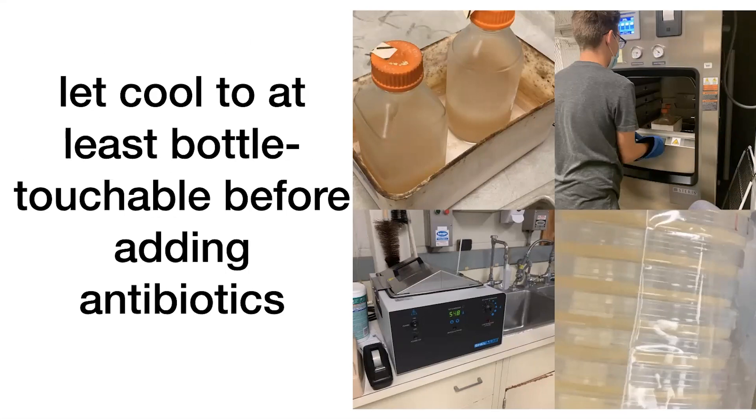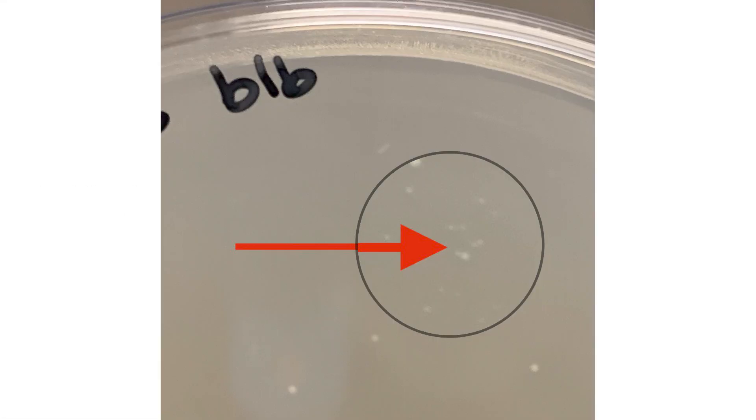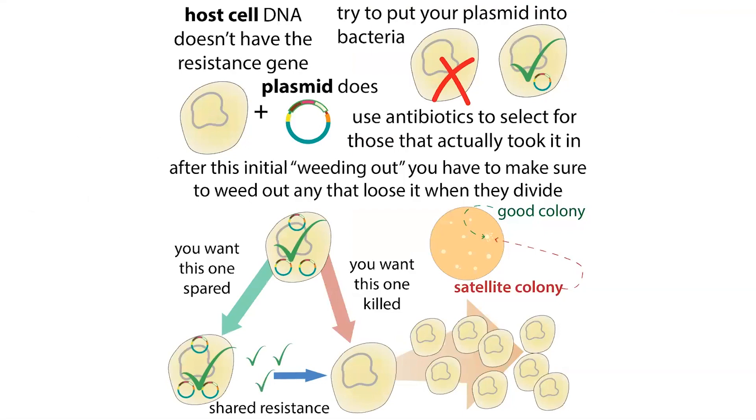Remember that satellite colonies are visible when they're on a plate, but if you grow bacteria in liquid media, you're still going to have the secretion and that potential problem of cells in there that don't have the plasmid — you just won't be able to see them. The nice thing about colonies is that you have these individual clumps of genetically identical bacteria. One bacterium takes root and grows and copies itself, so all of that clump should be genetically identical. In liquid media, everything is mixed together, so you can't go and select the colony that actually had your plasmid while avoiding those satellite colonies.